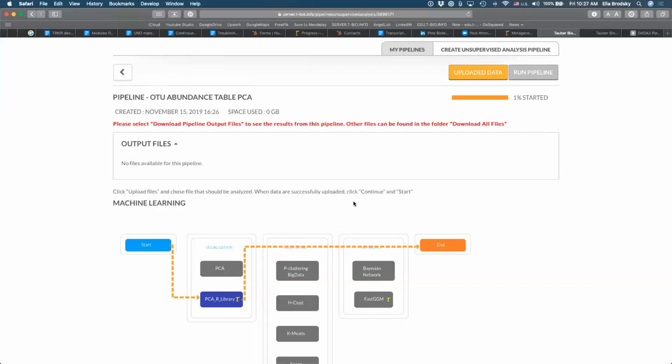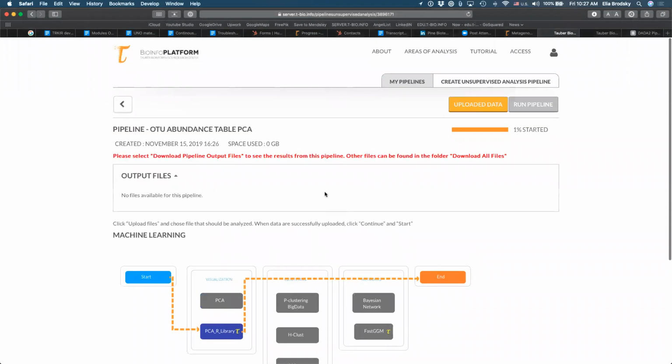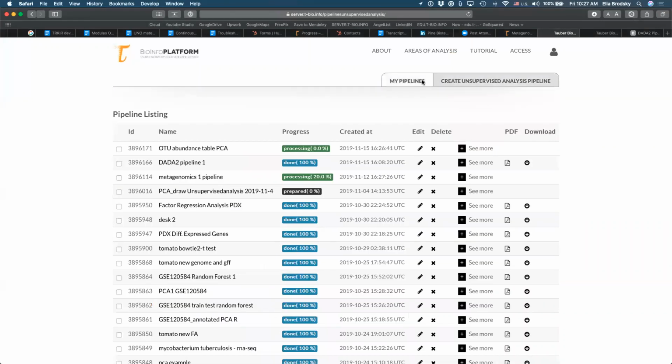So you can see here that I'm running principal component analysis to analyze variability between samples based on OTU abundance. Then, for example, I can see, well, okay, based on which OTUs. So I can start looking at it from that perspective. Which feature has more significance? Okay, does anyone have any questions about that?